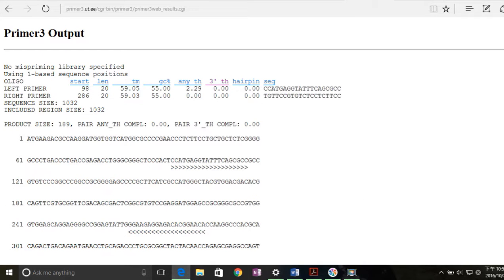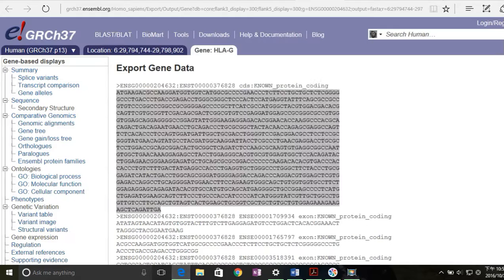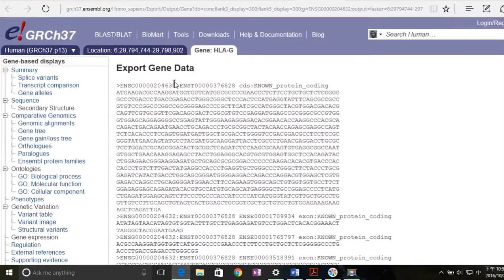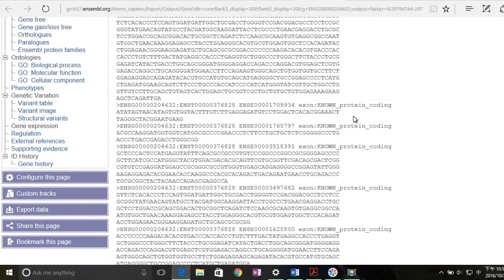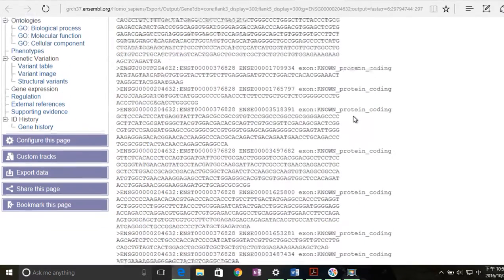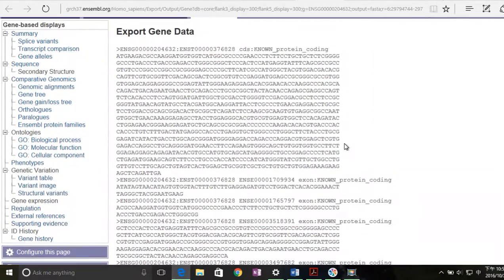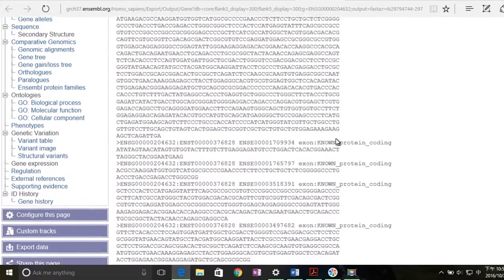Pick primers. So this one, the first one will be your coding sequence primer information. Do the same thing for the exon sequence. You are supposed to have a coding sequence and exon sequence at the bottom. There might be a possibility of several exons, because if you look back into how the genes is translated into the proteins, there are several segments of exons, depending on which organism you are choosing from.